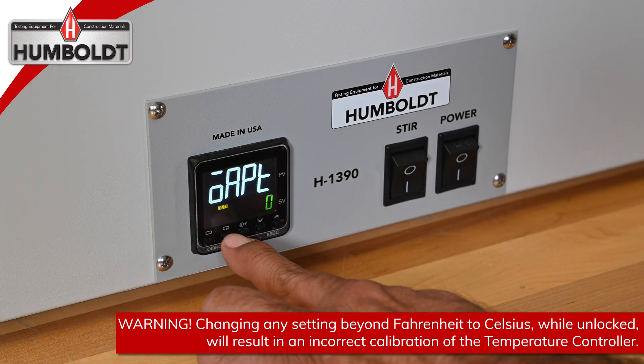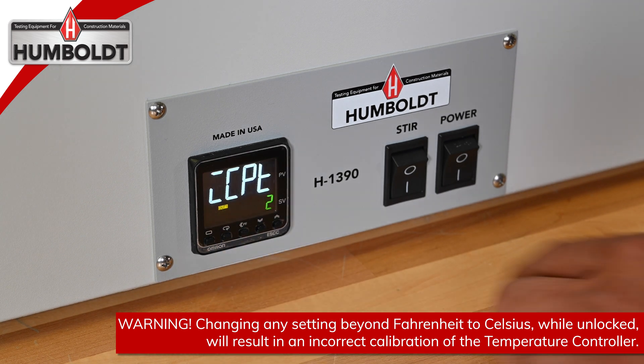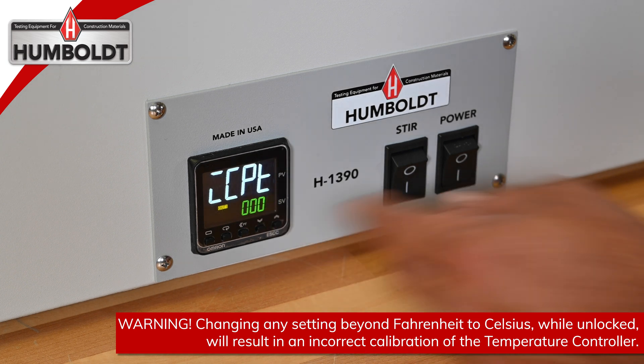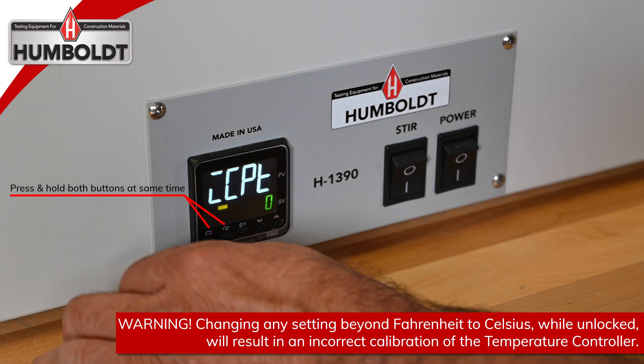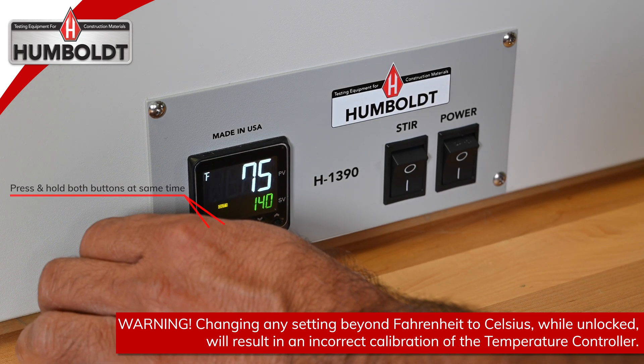Push the second button from the left and the display will now read CCPT with a setting of 2. Using the down arrow, change the 2 to 0. Press the first two buttons at the same time and your controller is now unlocked.